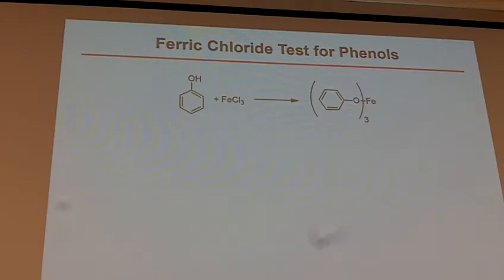The ferric chloride test will react with phenols and not just regular alcohols that are not phenols. So that's why we're doing this test first. Rule out if it's a phenol. If you get a negative here, but then you get a positive for the CAN test, most likely that's not a phenol, that's just another type of alcohol, okay? So that's why we're doing it in this order.